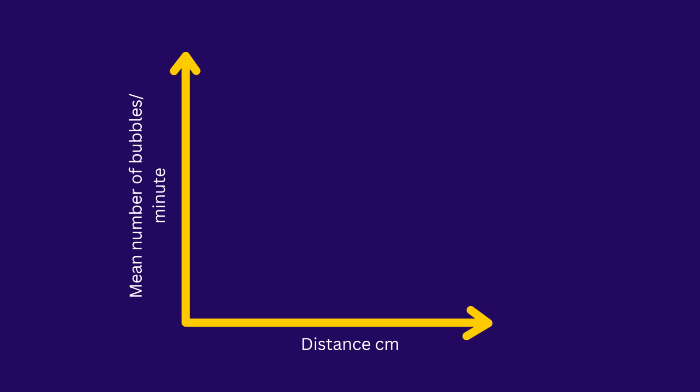With the data you have acquired, you should be able to draw a graph, mean number of bubbles against distance, and the graph should look similar to this one. So let us now analyze this graph.